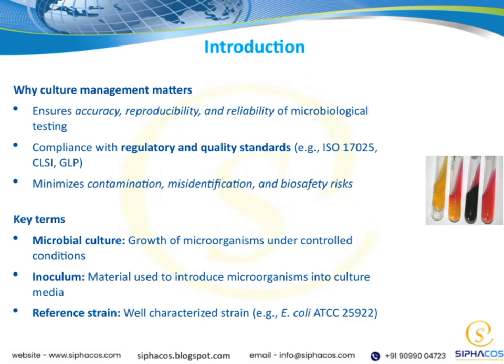Now, let's clarify some key terms. Microbial culture refers to the growth of microorganisms under controlled conditions. Think of it as cultivating bacteria or fungi in a lab setting. Inoculum is the material we use to introduce microorganisms into the culture media, essentially the starting point for our cultures. And a reference strain is a well-characterized microorganism, like E. coli ATCC 25922, which we use as a standard to compare and validate our testing procedures.